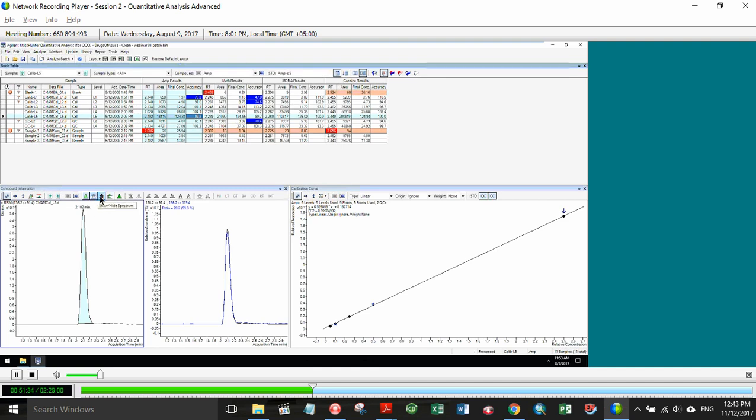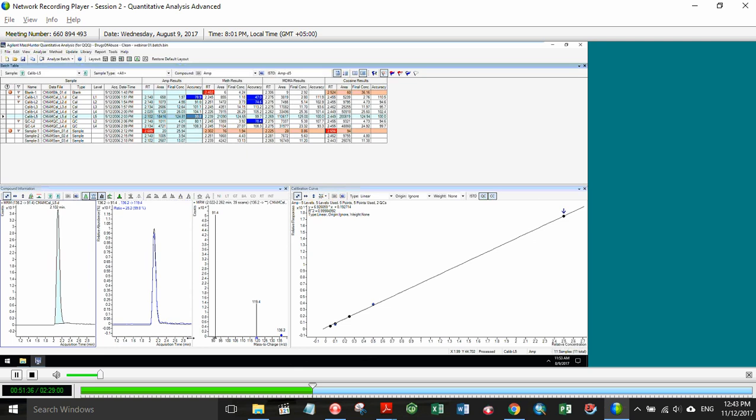If we hover over this, we can see what we're going to do. Spectrum, which even for MRM obviously is a little on the simple side, but it is kind of nice that it does show our target ion that we did MS on, and it shows color-coded down here the qualifiers and quantifiers, so it can be useful.